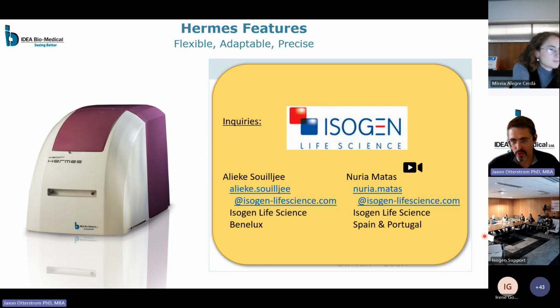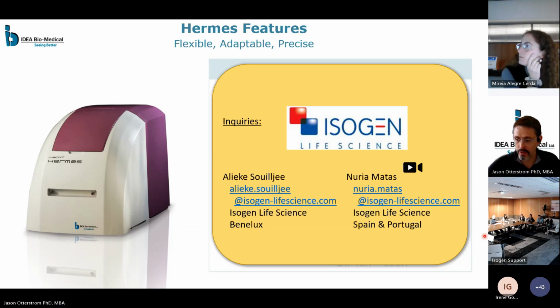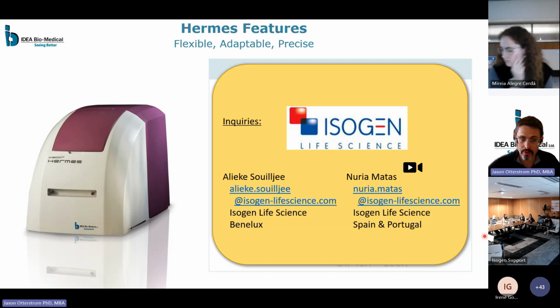So for me, it took maybe 10 minutes. I have quite a lot of experience in defining the analysis parameters. What I find is when I'm training new users or during a demo, it takes about half a day for somebody to learn the software and identify their own parameters.